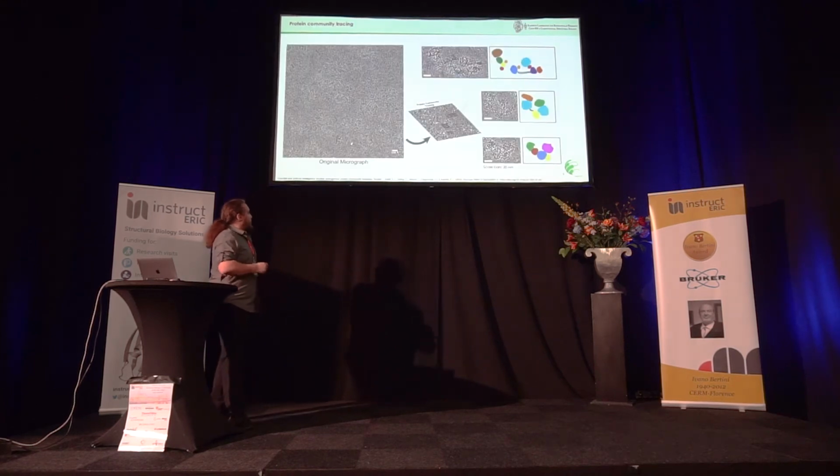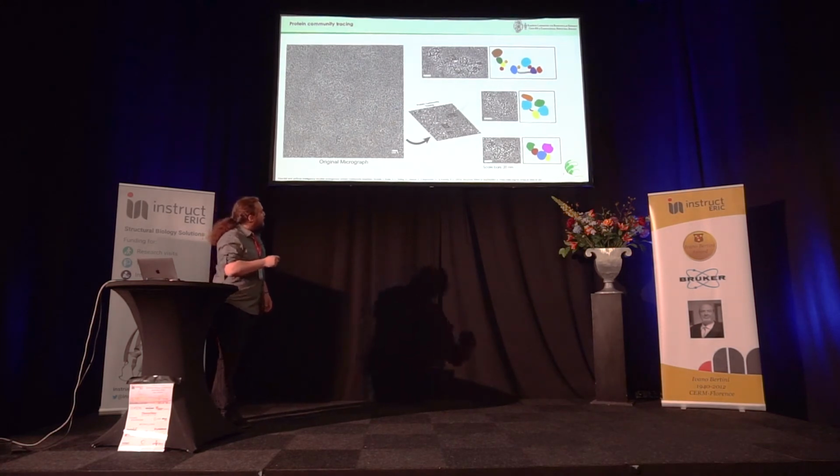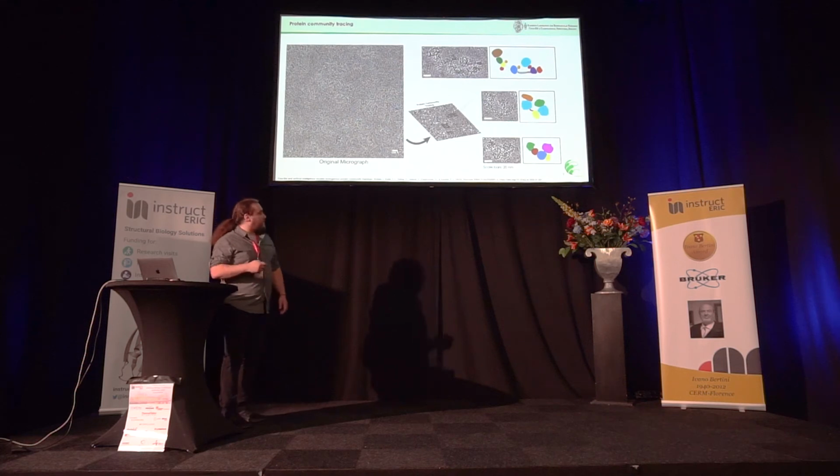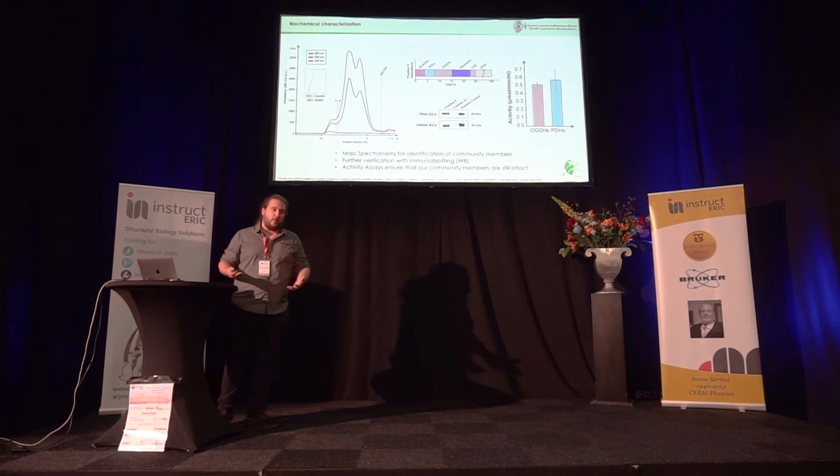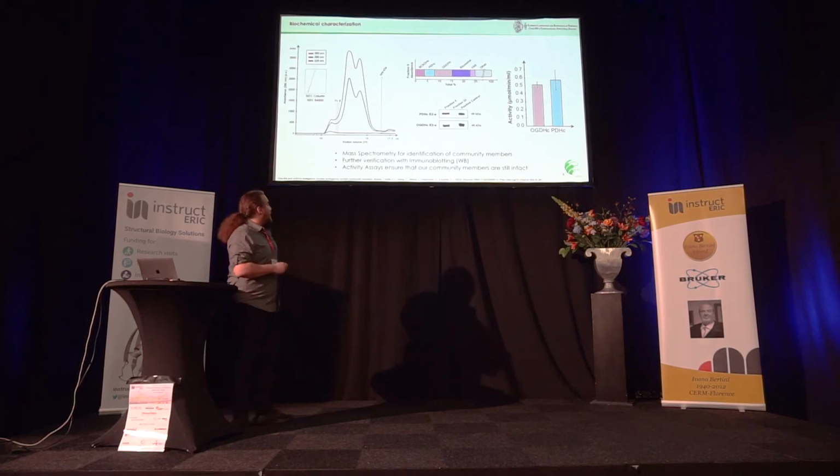In initial screening sets, before the major acquisition, we could again identify this type of community assemblies amongst proteins, with again some filamentous signatures over here, helping assemble all these together. After we see this, we once again go to our sample and biochemically characterize it.